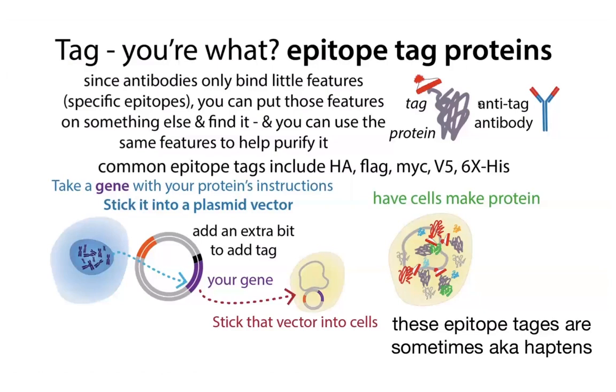It's harder when we're doing things in eukaryotic cells, but there are ways, with viral vectors and things like this, CRISPR, all sorts of different strategies, to introduce a tag. When you introduce a tag, now you have a version of the protein that you can detect. Not only can you detect it, but you can also pull it out, see what it's bound to, and things like this. Now, when you're using a tag as an epitope, you typically want to use something small, so it's not going to interfere with the protein.